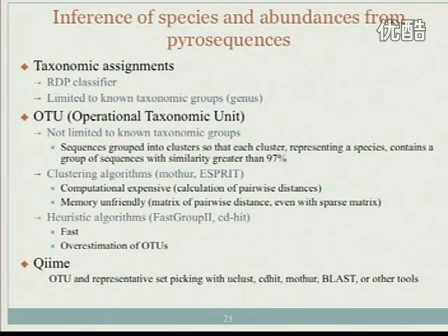For a genus, you can use a higher cutoff, but anyway, you can just use a cutoff of 97. How many OTUs will you get if you use a 97% similarity cutoff? Essentially, it's a clustering problem. You can use, for example, average linkage clustering, but the problem is that for all those clustering algorithms the complexity is n squared. So if you have so many reads, you cannot even do average linkage clustering.